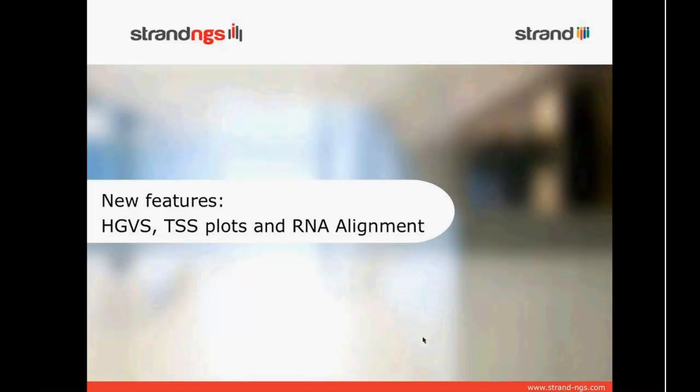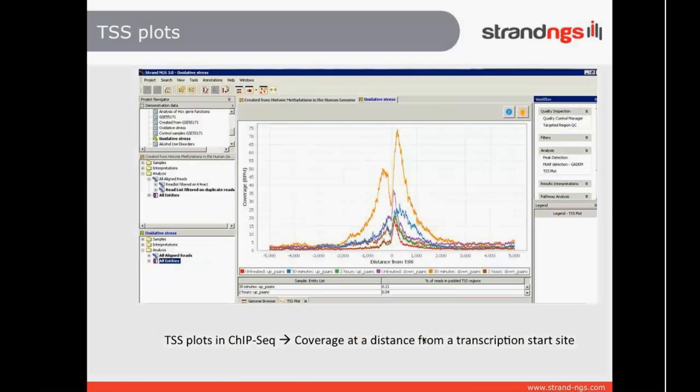So this is a broad overview of the new features. There are a lot of other new features. I recommend that you look at our reference manual and our release notes if you want to know more. But first of all, let's just look at TSS plots in ChIP-seq.